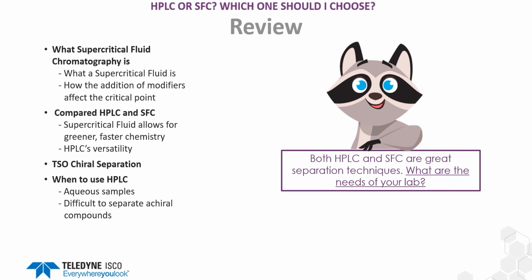So there's not an exact answer to that question. And I know probably some of you were tuning in to this webinar to get an exact answer to that question. Should I use HPLC or should I use SFC? And that's going to just vary from lab to lab. It's going to depend a lot on what the analytical needs of your laboratory are.